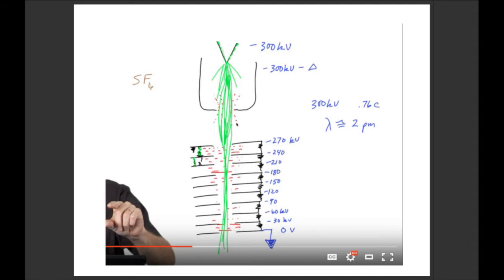The next feature that the electrons go through is what's called the accelerator stack, and he draws 10 of these. They're basically just discs with holes in them, connected by resistors that create this graded potential, which helps to create these perpendicular electric fields, in red right here across the accelerator stack, that help to accelerate your beam through the stack so that it emerges onto your sample.